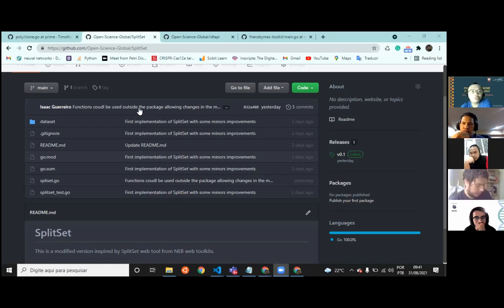Yeah, one limitation that we have right now is when we use the generated primers, we don't seem to be able to get a high PCR efficiency. So the product that we have is still very difficult to sequence, even for Sanger sequencing, because the PCR efficiency is just low. Maybe that's also one thing that we can look into. Yeah, but what else? I think so far those are the few things that relate to me.